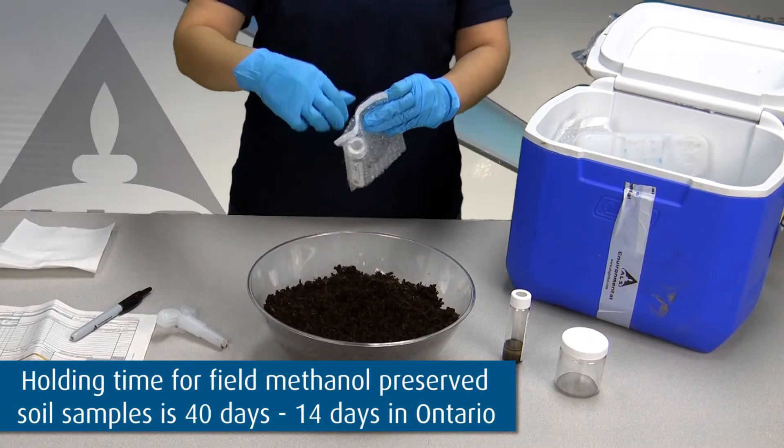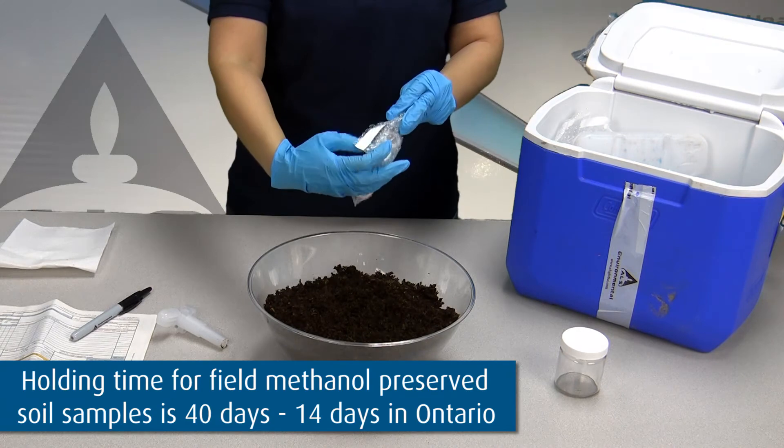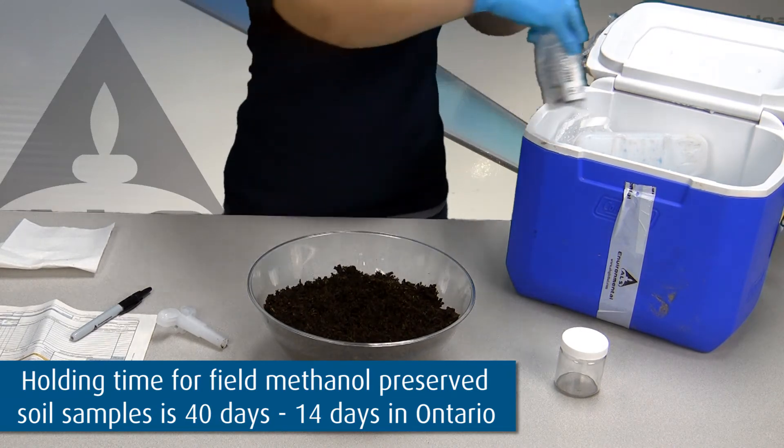Pack the two 40 milliliter vials upright in the bubble wrap bag supplied and place in the cooler at 4 degrees Celsius.